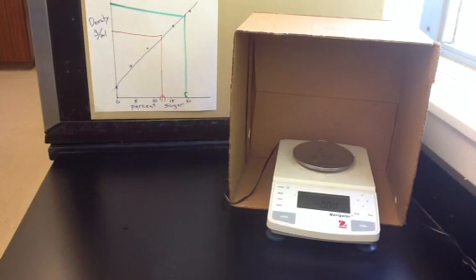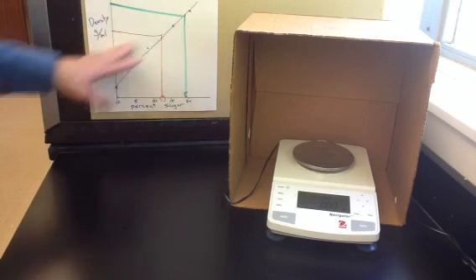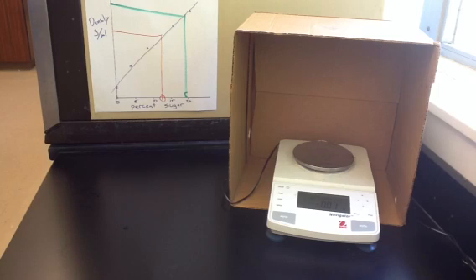Okay, that should be all the data you need in order to calculate the density of the standard solutions, to make the graph, and then to approximate the percentage of sugar in the 4 beverages using your graph.